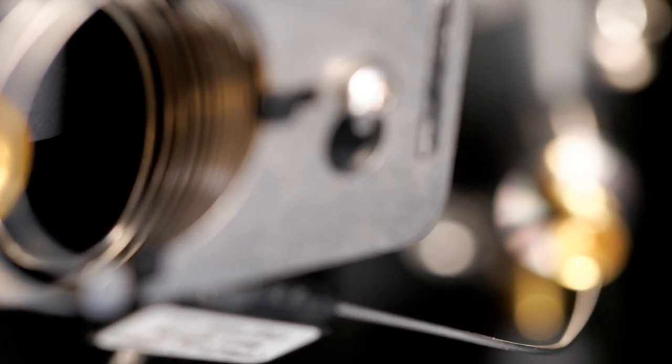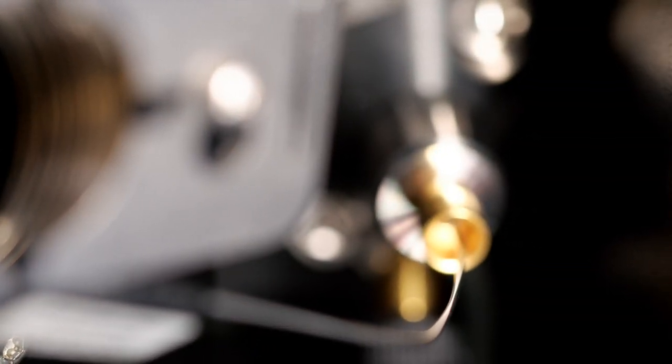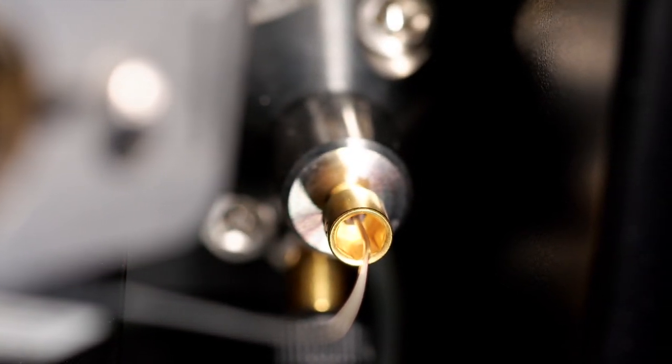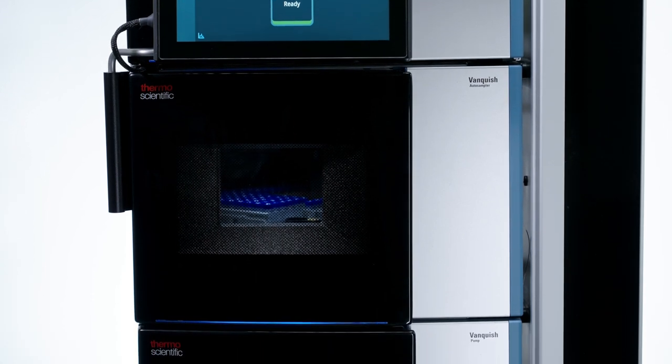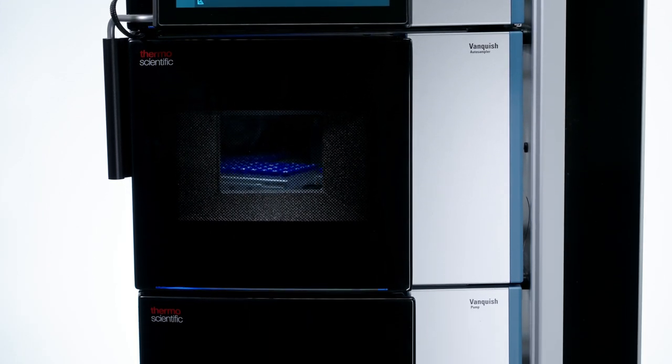For applications requiring advanced workflows, application-specific VanquishFlex system configurations add capabilities such as automated method development, increased system productivity, and enhanced confidence for complex samples.